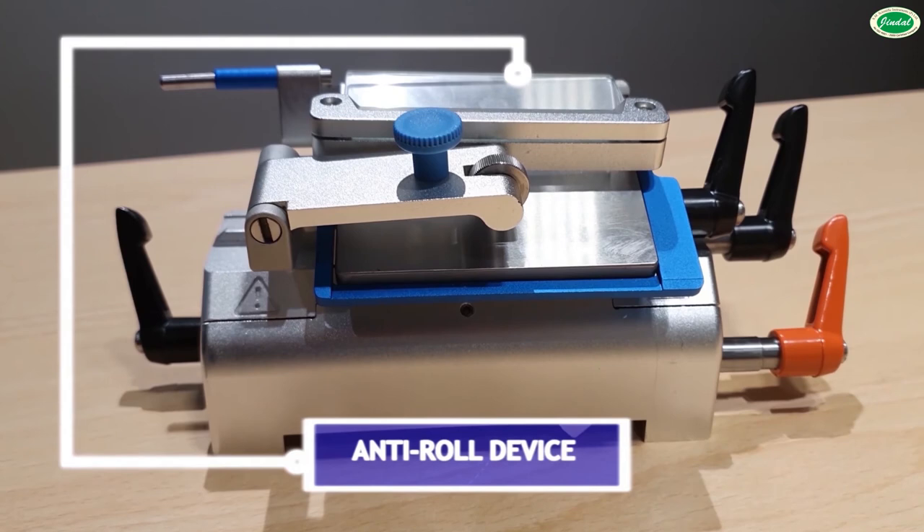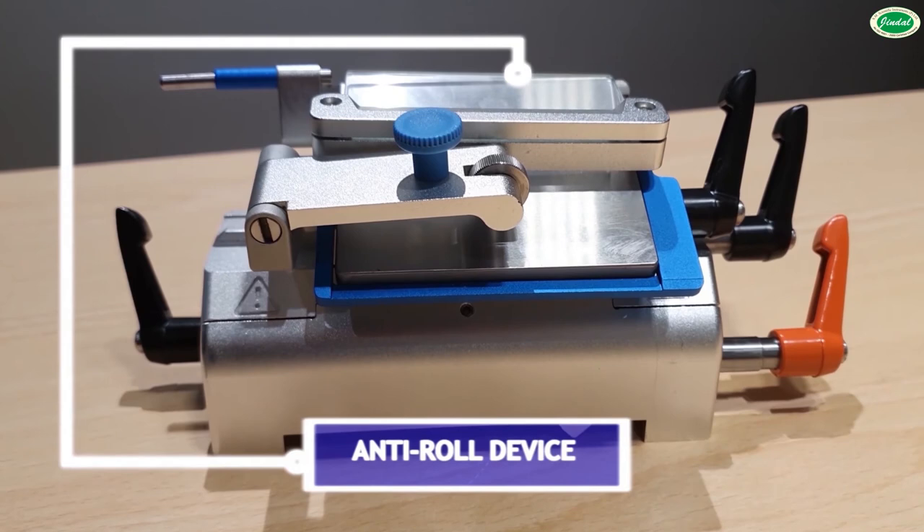The glass anti-roll device allows adjustment of angle and gap with the pressure plate, and the system features adjustable cutting angles.